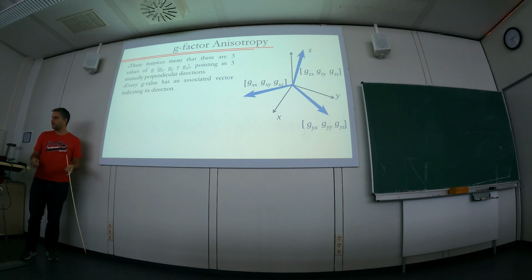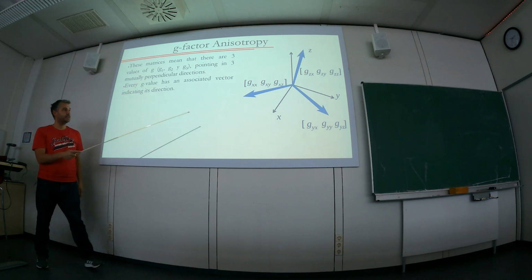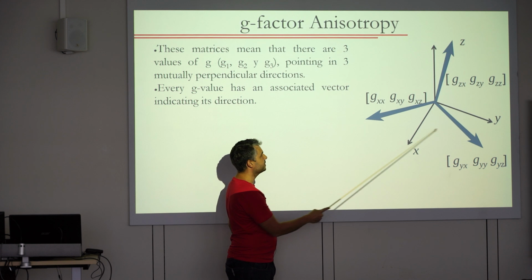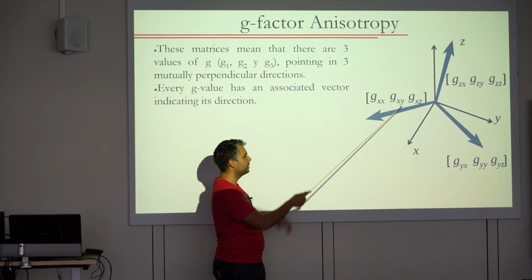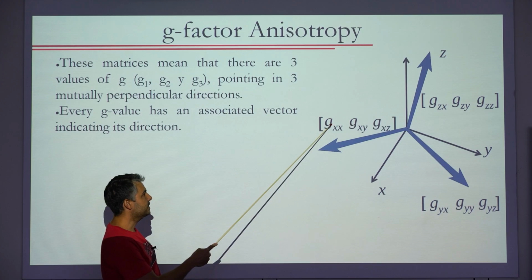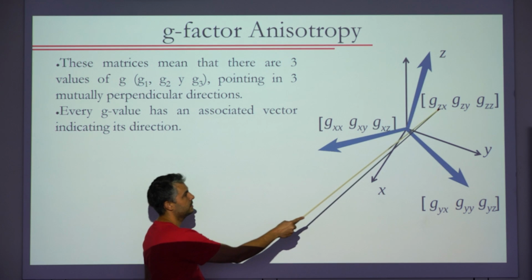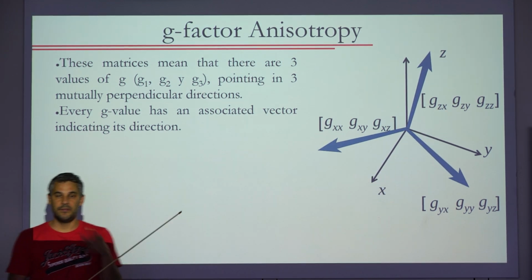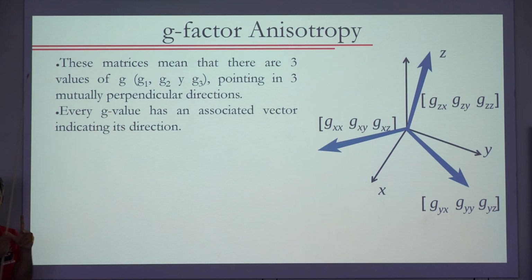Luckily, okay, before that, this means that you have a coordinate system x, y, z, and a G matrix defined by 3 vectors which are perpendicular to each other and point in some directions. These have components: gxx, gxy, gxz, gzx, gzy, gzz, etc. They don't have length 1, they can have different lengths, but they are orthogonal, 90 degrees between each of them.